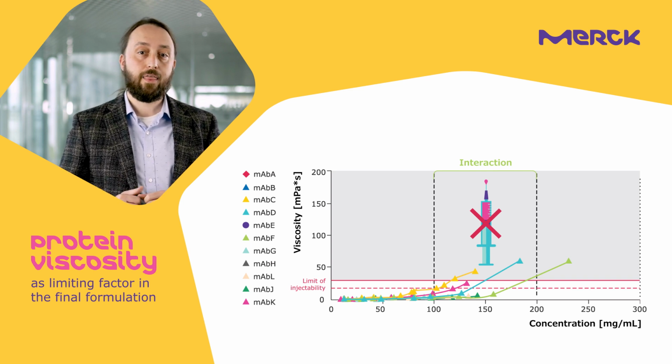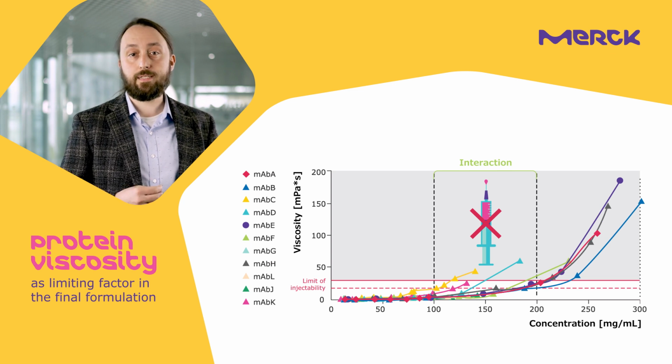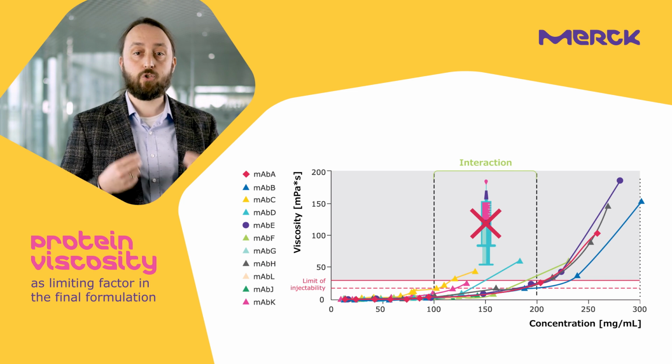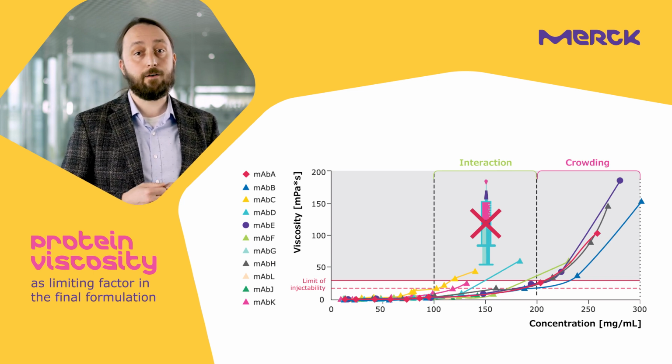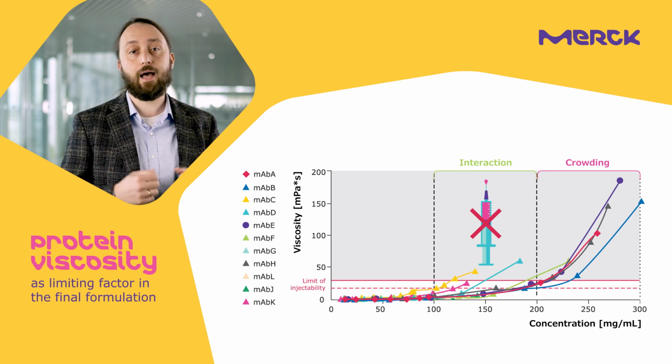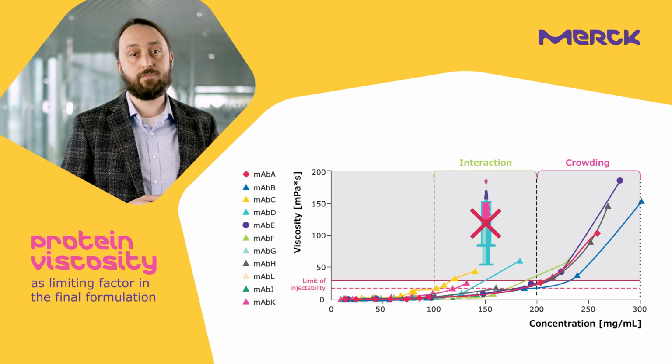Other proteins that become viscous only above 200 mg per ml also form these transient clusters, but here the next neighbor distance in between the molecules is simply too short and too narrow, similar to visiting a crowded football stadium when you are bound to interact with your direct neighbors. Here these transient clusters are formed by crowding, by the high concentration, and ultimately also give rise to protein viscosity.